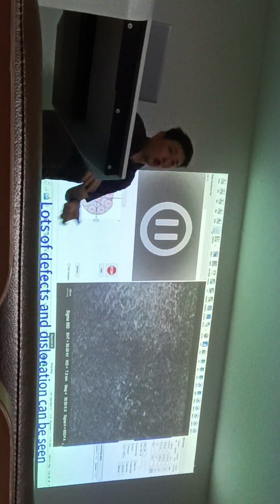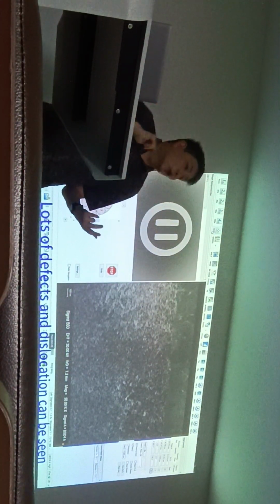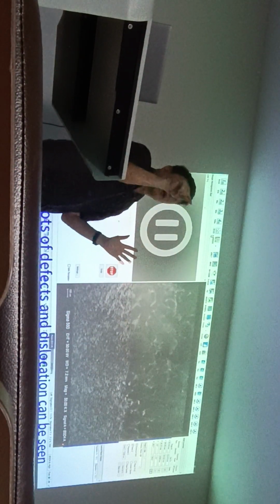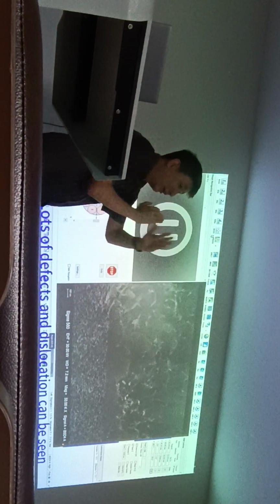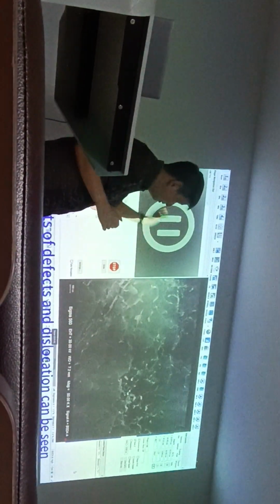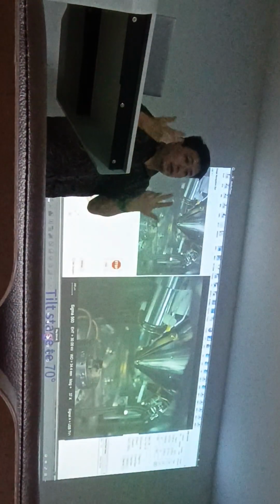Yeah, and we can move it around. If we want another similar grain, go back to EBSD and copy the Euler angle. What I normally do is that when I'm in EBSD, I note down a couple of Euler angles, so I don't need to keep tilting. I get a list of Euler angles I want to see. Then just do the simulation one time.